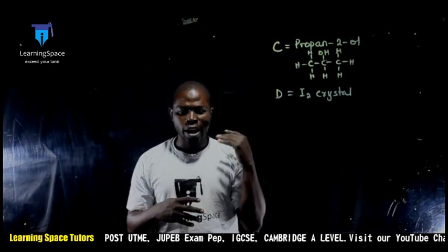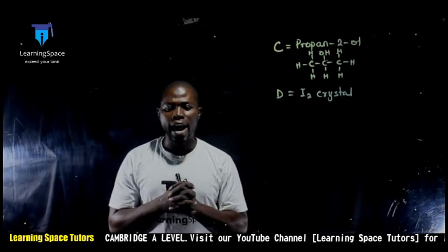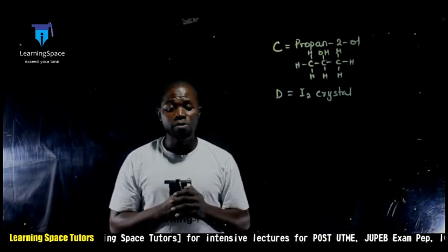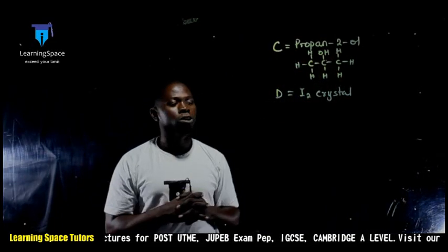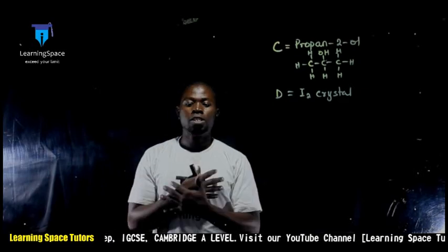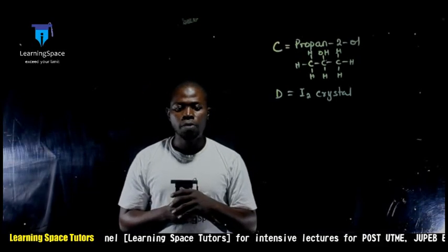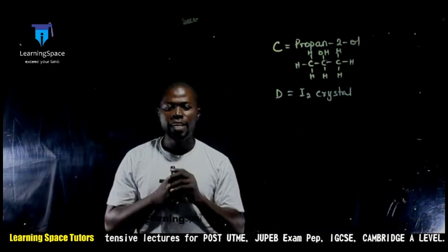Now that is for question 1a(i). They said to about 20 cm cube of portion of C, which we know to be propanol. On a normal good day, you are not supposed to know if this is propanol or not. You are just supposed to be carrying out tests on a sample that you have no idea about. So you add acidified potassium heptaoxodichromate(VI) solution.